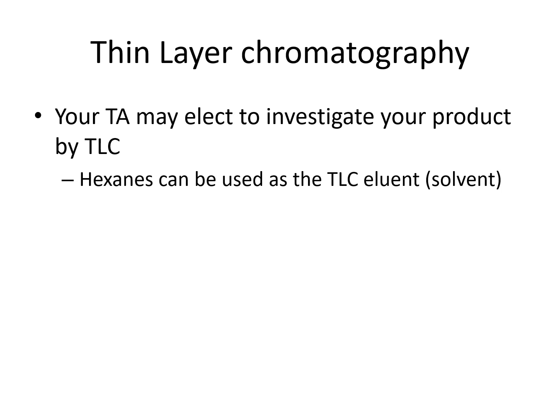Thin layer chromatography will be used to show you if we have synthesized the compound purely, and we'll do the TLC for you under hexane as a mobile phase.